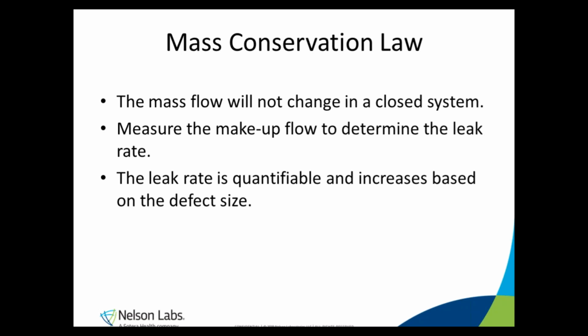The leak rate can be influenced by a number of factors. The biggest one is the amount of free space in the test chamber, and it will change slightly from one configuration to another. So there isn't a single flow value that equates to a certain size defect. This would need to be determined with each test setup. The flow rate is, however, consistent using the same test setup repeatedly over multiple days.